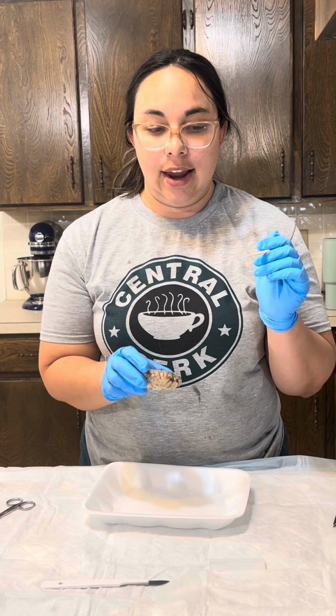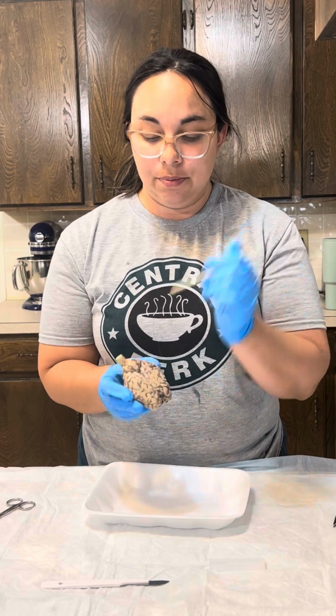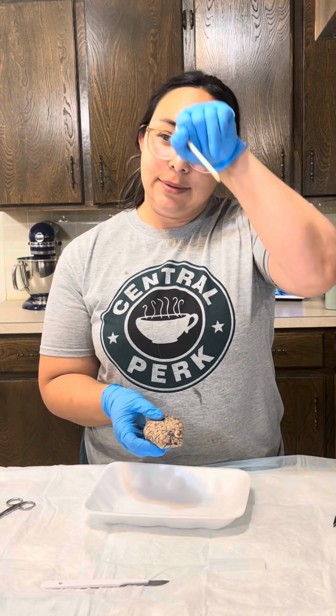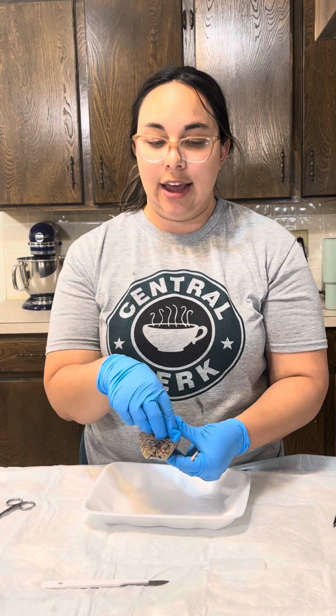Okay, and I got ahead of myself a little bit. So turning back to this side, the brain has different lobes to it. We've got the frontal lobe right here, and that has to do with your personality. If you get smashed here, there's a lot of personality things that can happen. And then we've also got the parietal lobes, which are the two right here, and they have to do with spatial relationships.